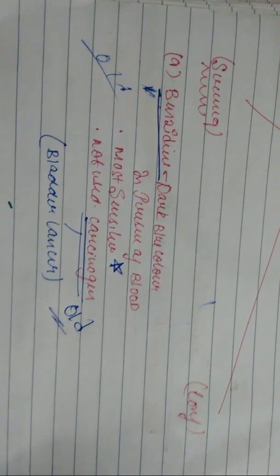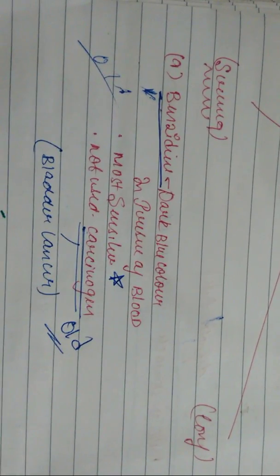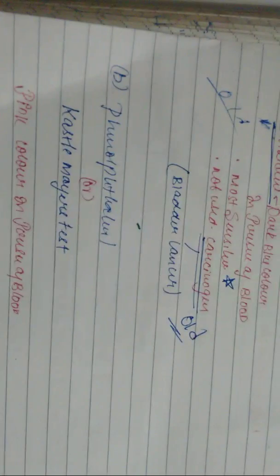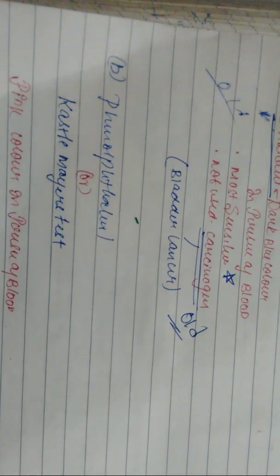I think I didn't miss any of the points from the benzidine test. So yes, I didn't miss. Let's go with the next test. The next test written in our notes is the phenolphthalein test, or Kastle-Meyer's test.